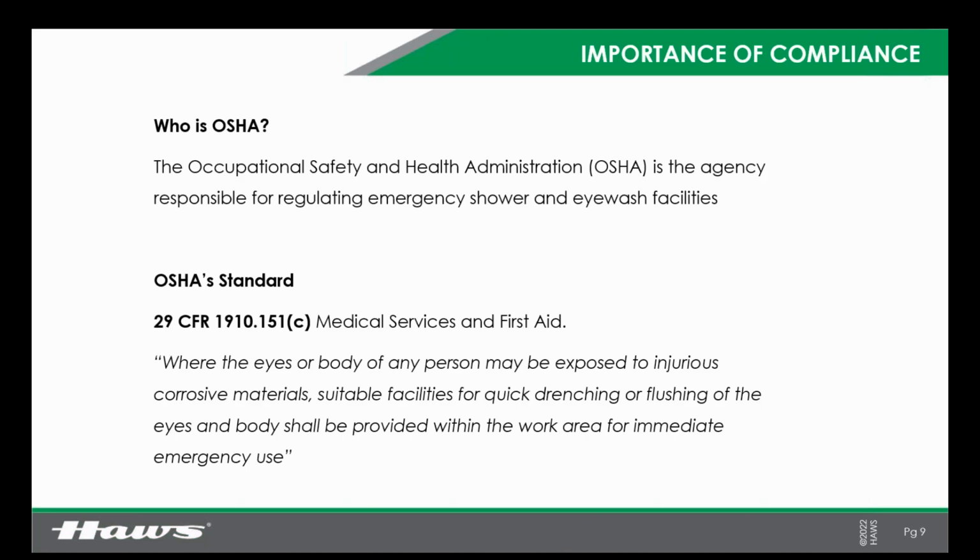OSHA, not quite the boogeyman everybody makes them out to be, but some people do treat them that way. They are the folks responsible for regulating emergency shower and eye wash facilities, and they have their own standard. That's OSHA's 29 CFR 1910.151(c), under medical services and first aid. The information they give us is really just a paragraph, but they tell us where you might be exposed to injurious corrosive materials, you need suitable facilities for the quick drenching and rinsing off of your eyes and skin.